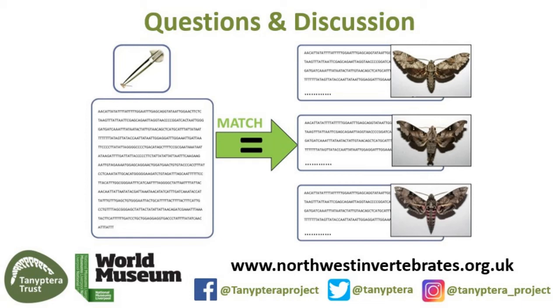Yeah, just a quick question, John. What are the problems of cross-contamination of some of these DNA sequences? So, how do you prevent it occurring? Yeah, it can occur. The idea would be that if you're taking, say, for example, a leg from an insect in order to sequence that, maybe you've touched another insect previously and then you've touched that leg. Is that the kind of contamination you're thinking about?